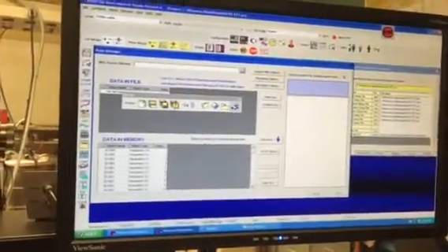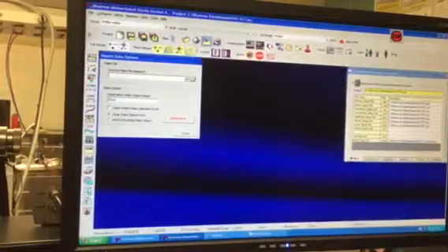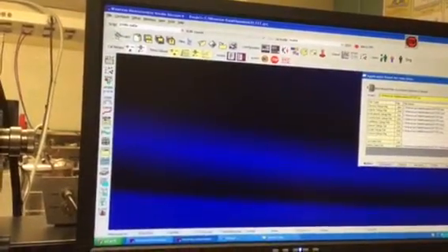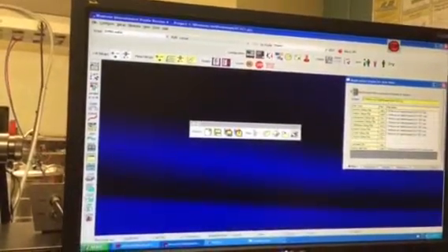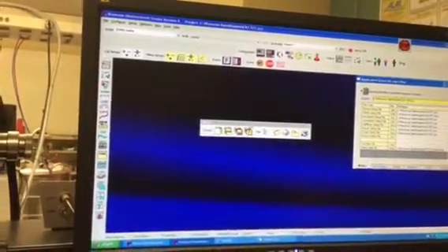Cancel. And then you can just throw it back up there and it goes back. But how can we get it if we close it mistakenly? If you bring this down and close it, you just click that and it comes back.